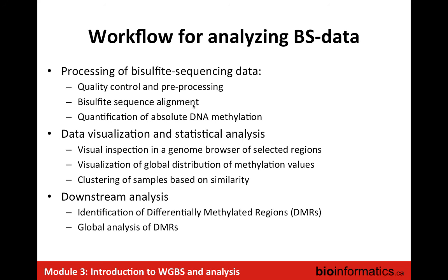That's also what we're going to be doing in the lab: some visual inspection of selected regions, looking at the global distribution of values. Again, that's quite similar to some of the things that you did yesterday, except that it's going to be done now in the context of methylation, clustering of samples based on similarity, and then some downstream analysis where you're looking at the differentially methylated regions.